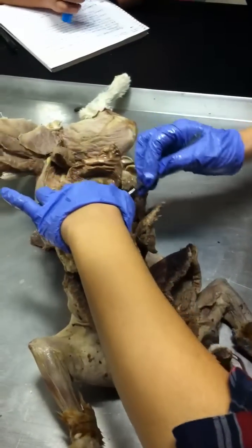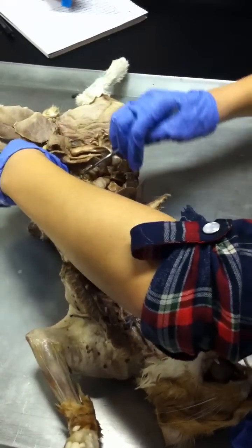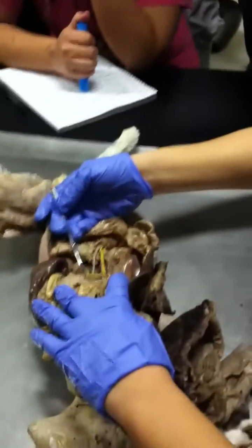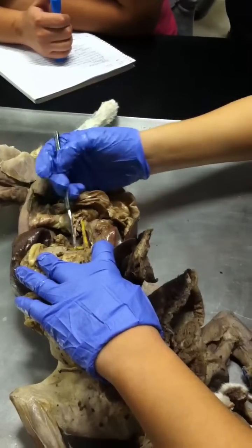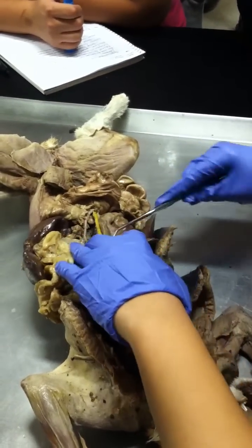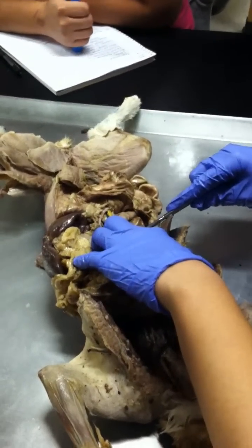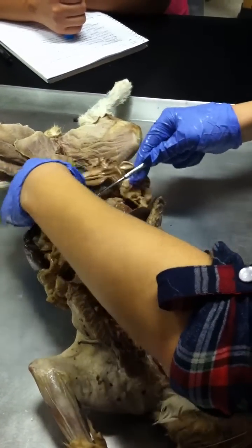Speaking of spleen, do you guys remember the blood vessels that drain to this entire region? This group did a very good job of cleaning out the hepatic portal vein system, right? See how this right here is the first blood vessel? That right there is the splenic vein, right? Once we pass the splenic vein and we're getting closer to the liver itself, this region right here must be what? Hepatic portal. So if I pin this region, okay, that's the hepatic portal vein. Splenic.